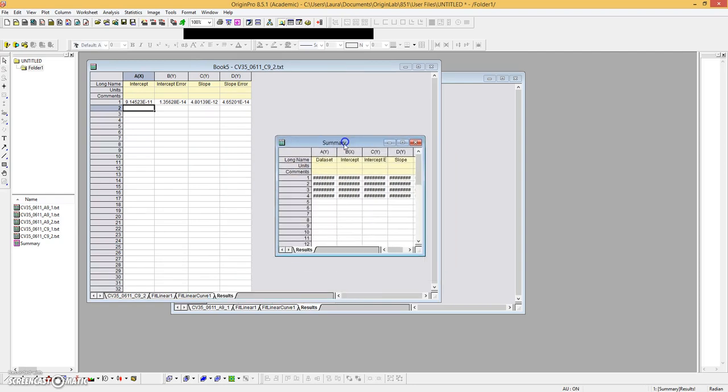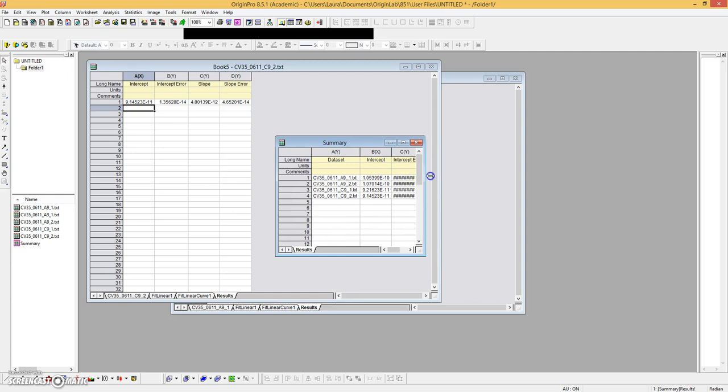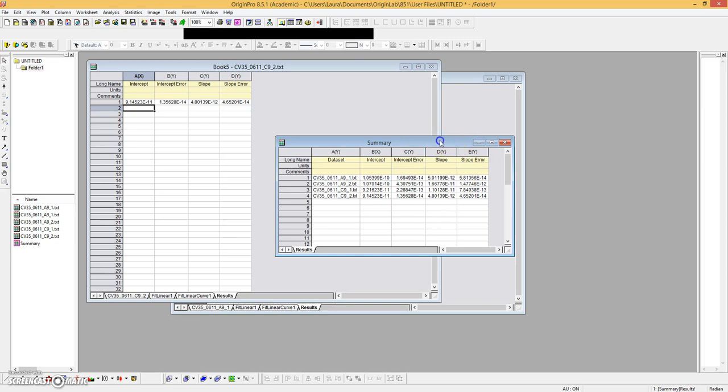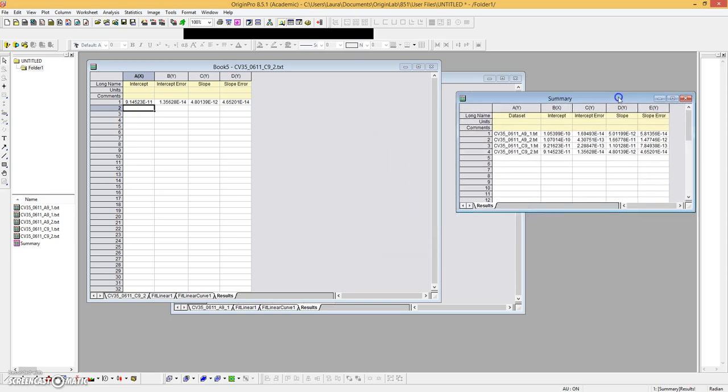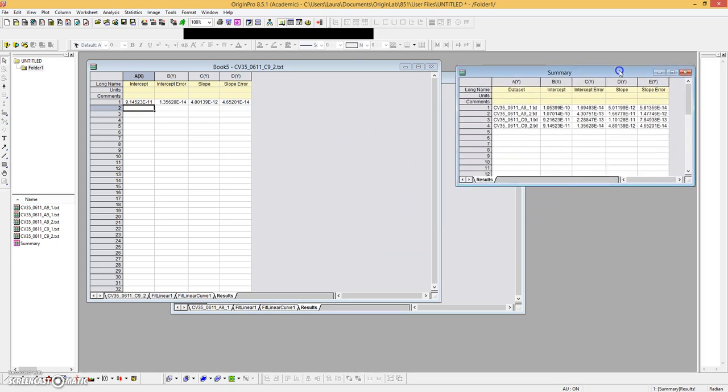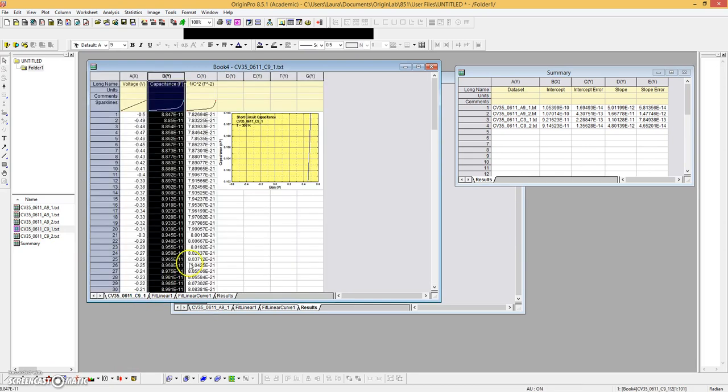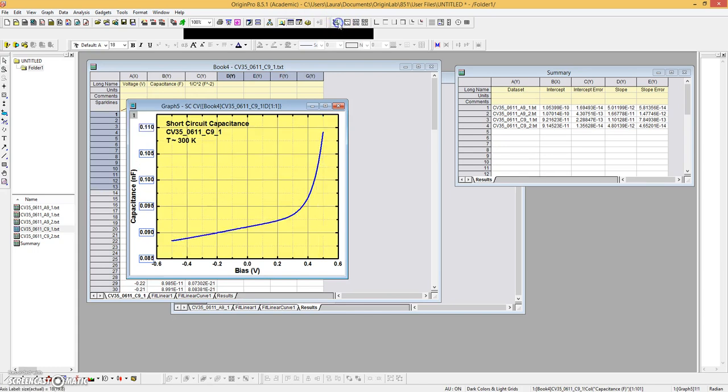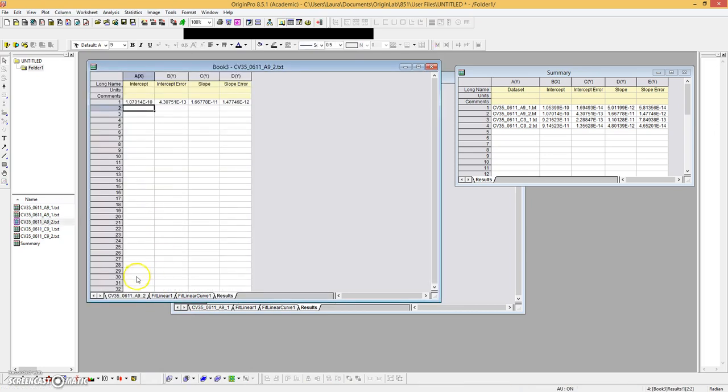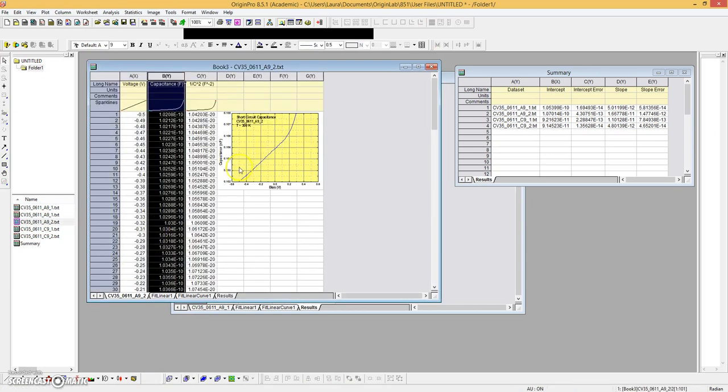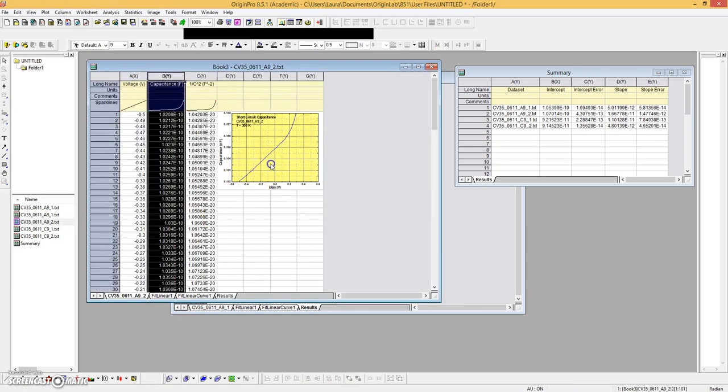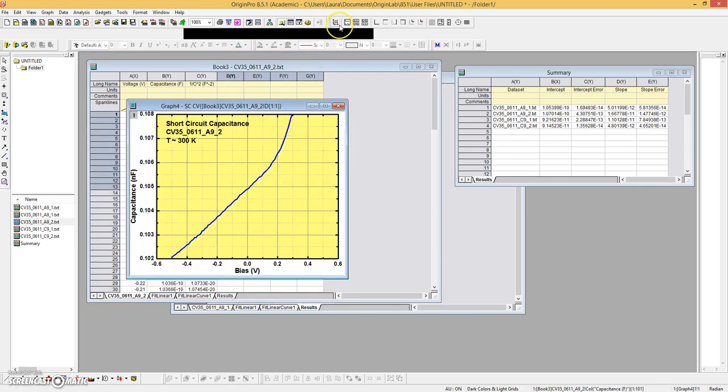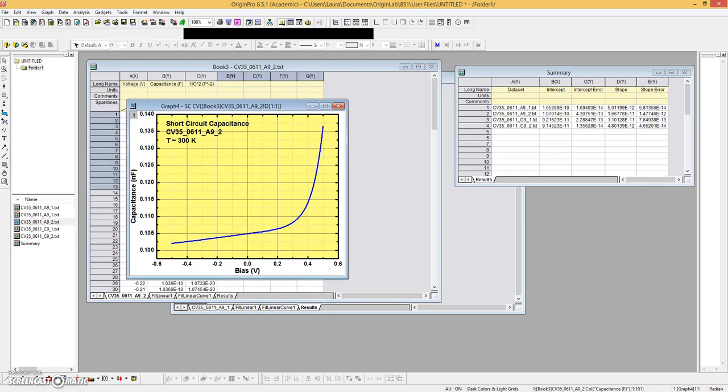So here's our summary. So for all four different files we have the result of whatever analysis we wanted to do, and you can take a look at each one. You can say, oh look, well, okay, obviously the scale's a little off on that, but I mean, over and over you just did the same thing without wasting a ton of time. So you're welcome. Okay thanks. Bye.